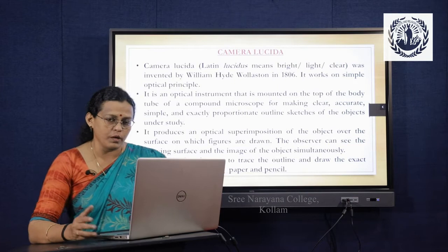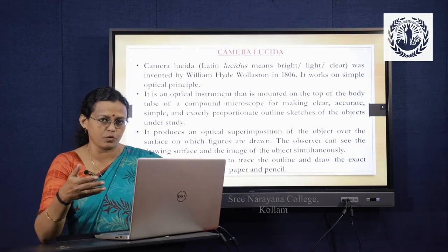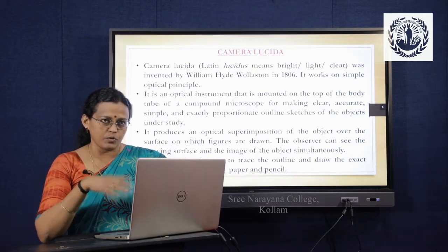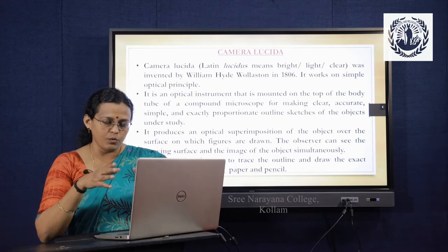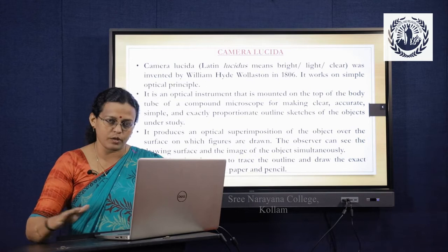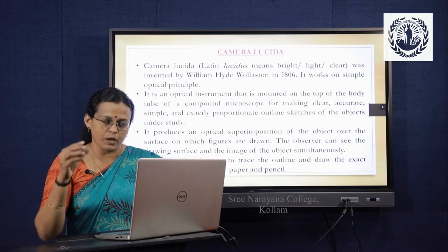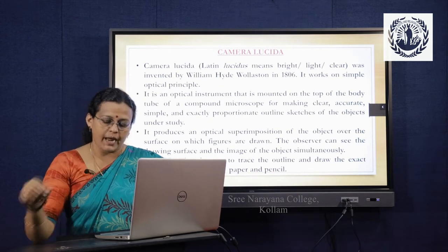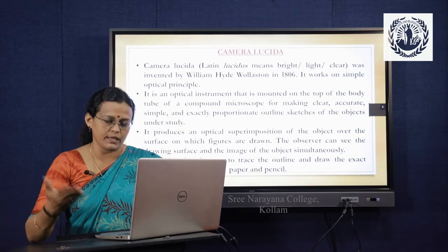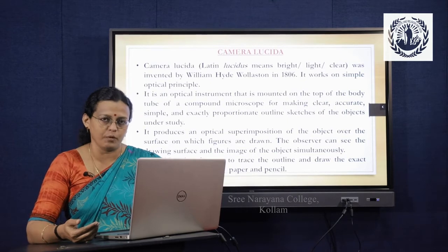So you know how to use a compound microscope. When you place an object in a compound microscope, of course you can view the image through the microscope, and by using camera lucida you can view the image on a drawing surface. So you place a drawing surface beside the compound microscope on which the camera lucida is mounted, and beside that you place the drawing paper on which you can see the image of the object that is placed in the compound microscope.